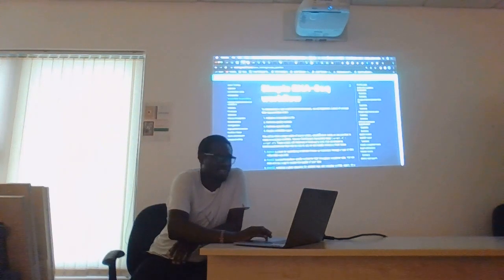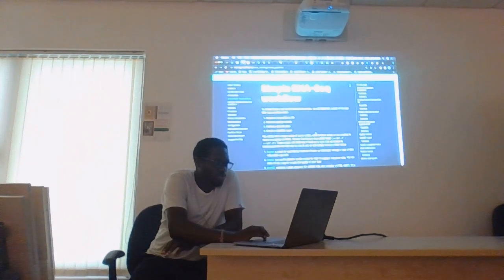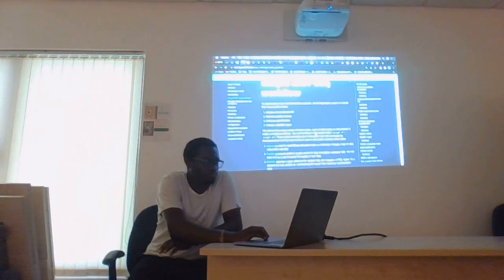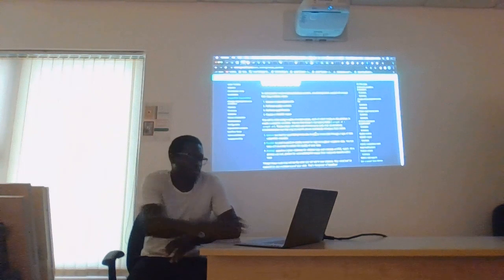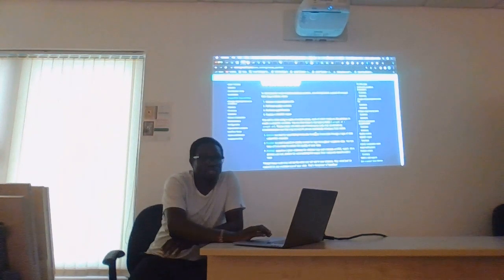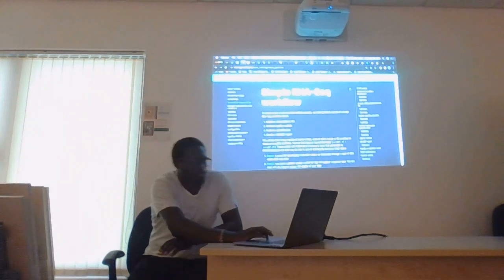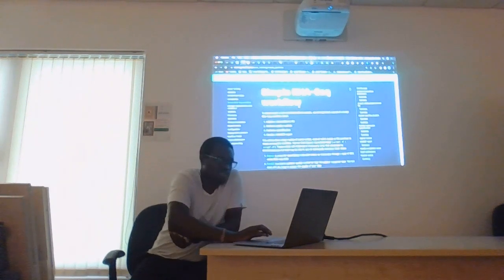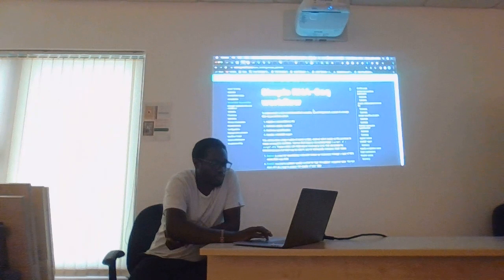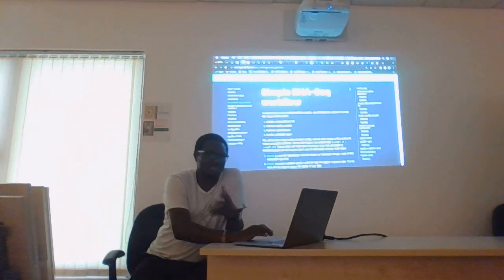It's okay. It's fine. I think we will have this opportunity to review what Nextflow is, what it's capable of doing, and how we can perform each of these steps in a Nextflow script. So the task was to replicate this simple RNA-seq workflow. So I will engage you. I will want to hear what you guys did.